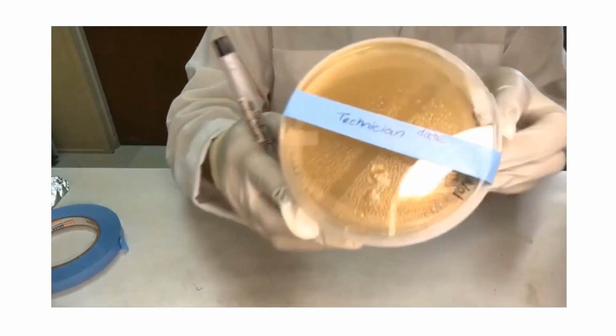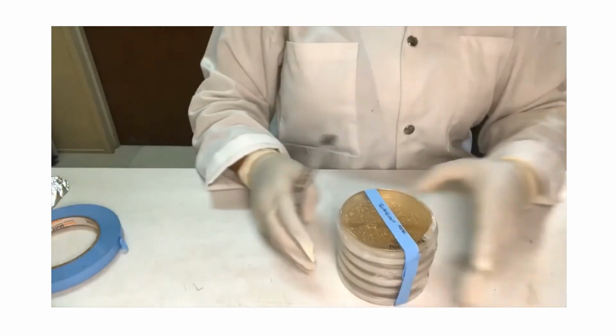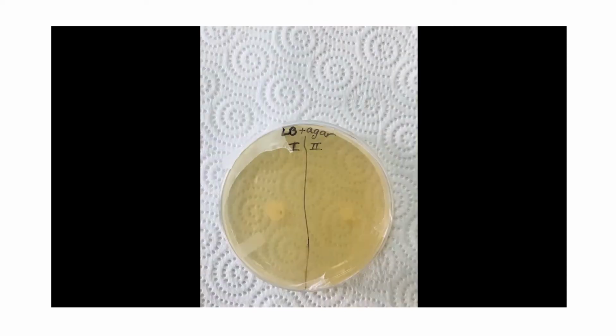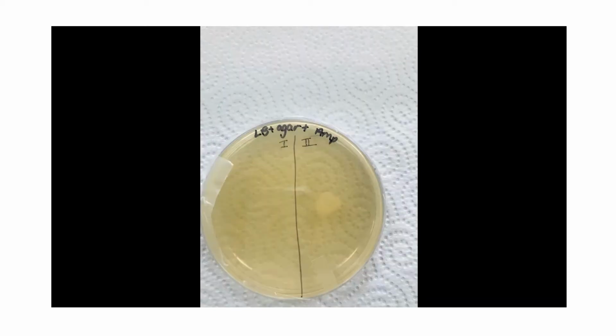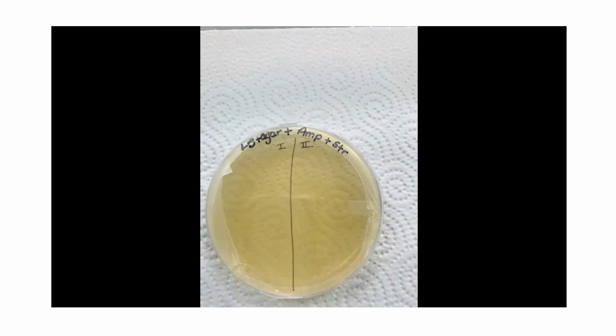The confirmation plates are placed in an incubator and left overnight to incubate at 37 degrees Celsius. After the incubation period, each plate is carefully observed to detect whether there was growth of bacterial cells, and these results are to be recorded in Table 1. So please take some time and pause the video accordingly at this point to observe the bacterial growth response.